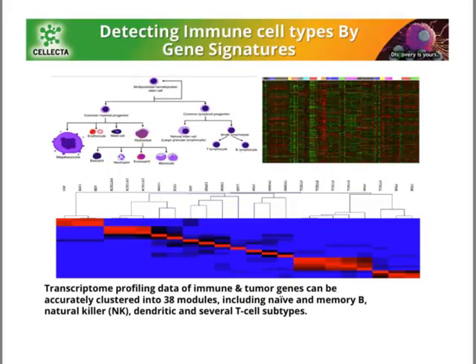If I could use just one slide, not getting into too much bioinformatics, I would use this. On the left are your hematopoietic immune cells. There are different immune cells. The higher the hierarchy is, it could be much bigger gene signatures. So in this assay, we're looking at gene signatures. A cytotoxic T cell, just to give you an example, could be a 60 gene signature, to a multipotent stem cell could be almost 500 gene signatures.